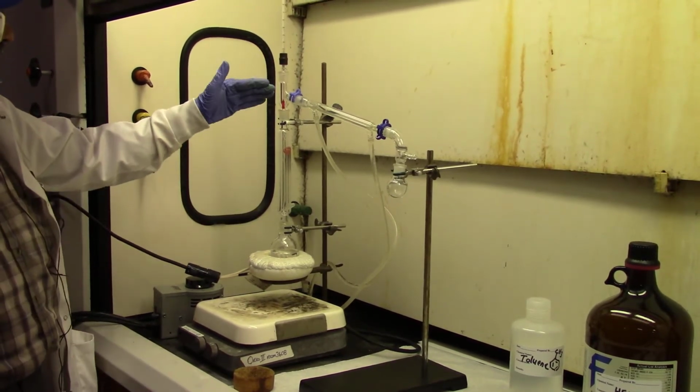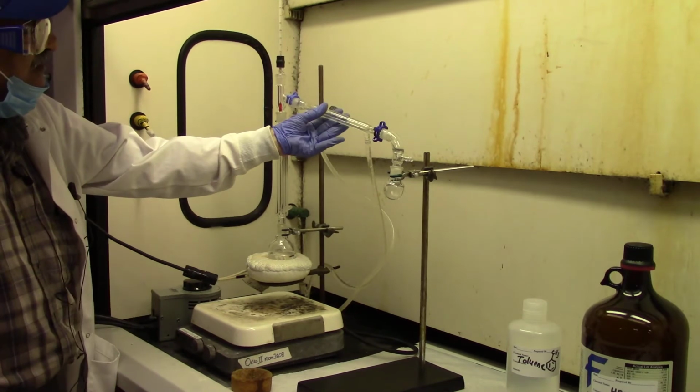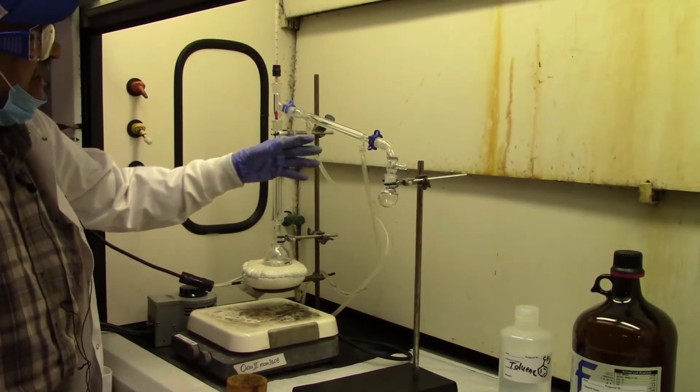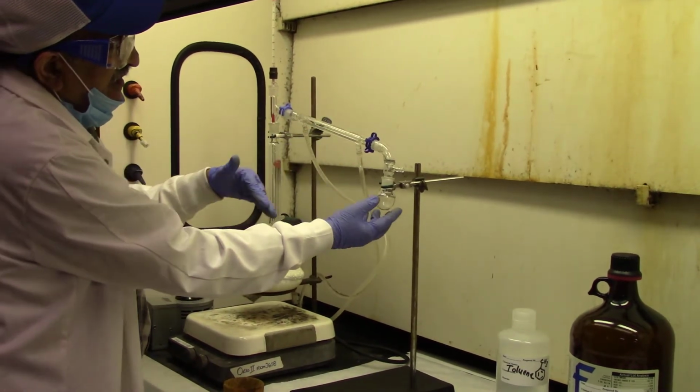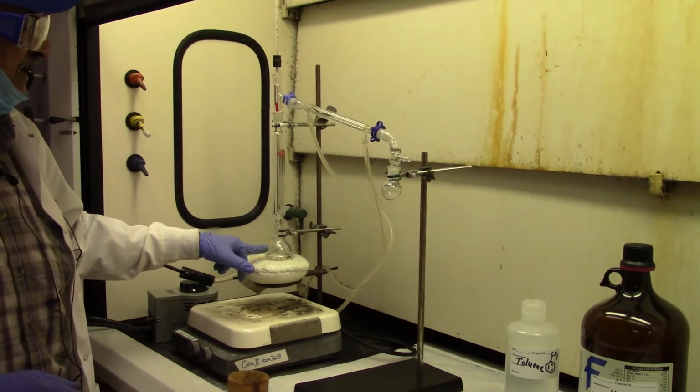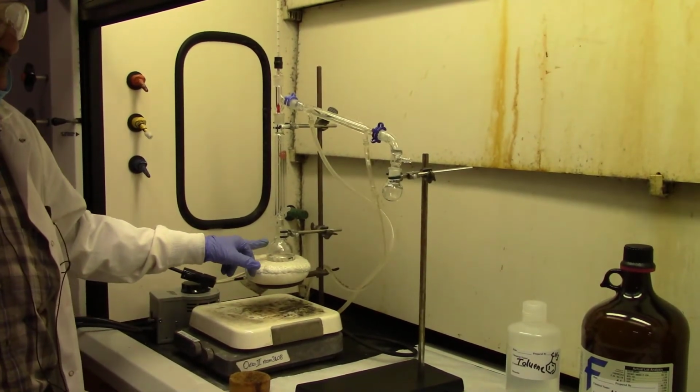Okay, we are heating it now, and hopefully the vapor will rise through the first condenser, the air condenser, and be condensed at the very end and collected in the collecting flask.